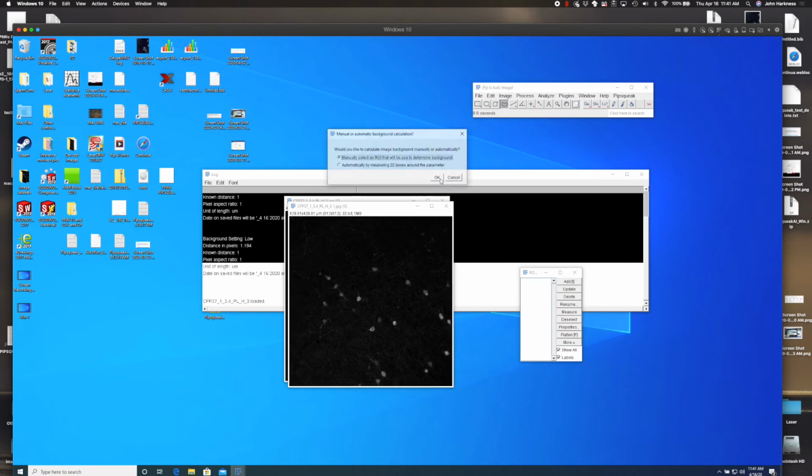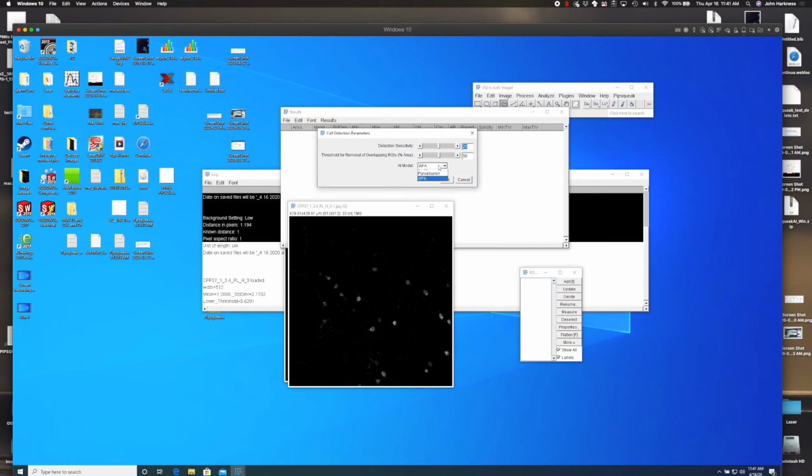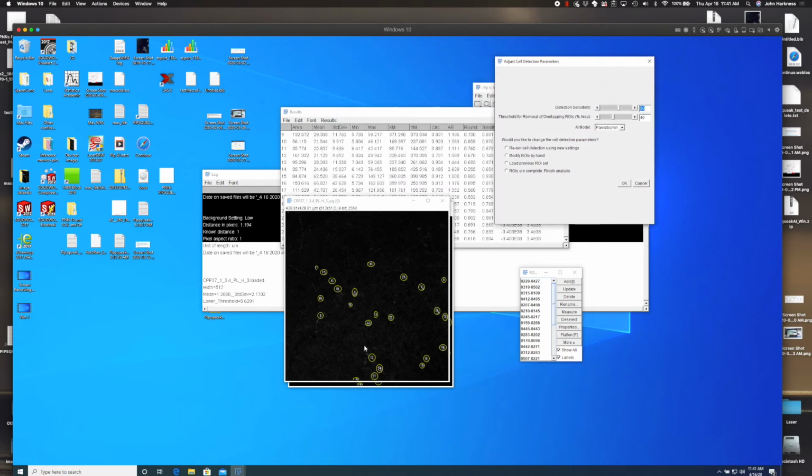I'm not going to limit anything here, and we'll just use the automatic grid of ROIs that we're all used to seeing. So here we'll open up Parvalbumin. I'm going to leave the settings pretty similar. Maybe let's take sensitivity up to 30, and let's take our overlapping back down to 40. That seemed to work pretty well for WFA. So again, it's sending it up to the server, and what we'll get back here in just a second is the predictions placed right onto the window. Voila. So I think that looks pretty good to me.